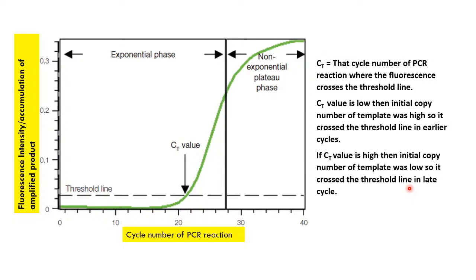If the signal is coming, it means you are infected. If the signal is not coming, it means initially RNA was not present, and if RNA is not present, you are not infected. So real-time PCR based kits are being used all around the world to detect corona. A simple principle based on what? Fluorescence, right? Now we just learned how SYBR Green is doing that.